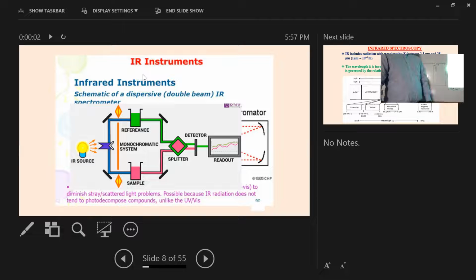What types of functional group does it have? The water molecule has an OH functional group, is it? So we can consider for the water molecule, this is symmetric OH, this is anti-symmetric OH. So for the water molecule, you will have 3 different types of vibrations, and in the IR absorption region we will have 3 different vibrational modes, and it will absorb the IR light only in 3 different positions.